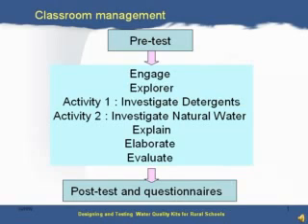In activity 1, investigate. In the explain step, students use the relations between dissolved oxygen and phosphate concentration to analyze their results and the quality of water sources. In the elaborate step, students use the findings of the study to consider any action or further investigations that might be useful.